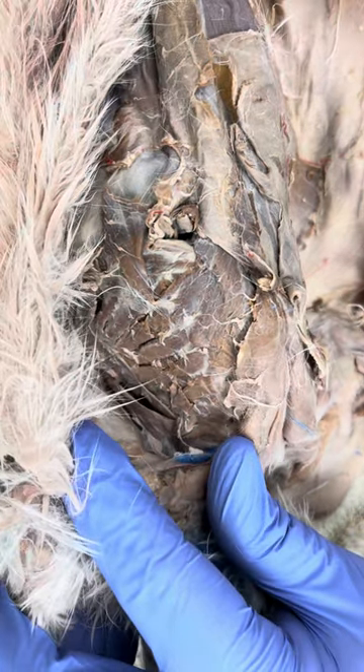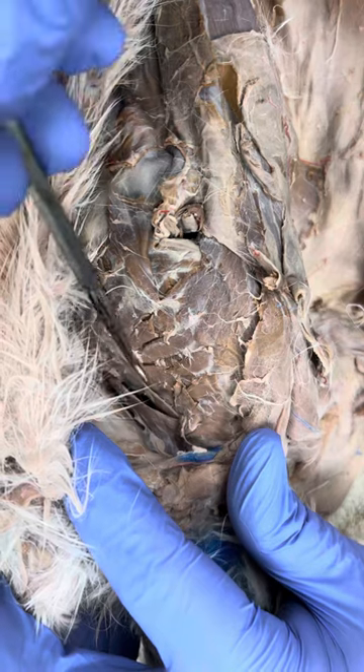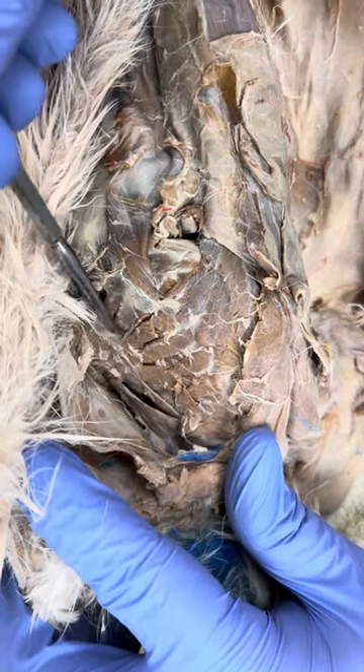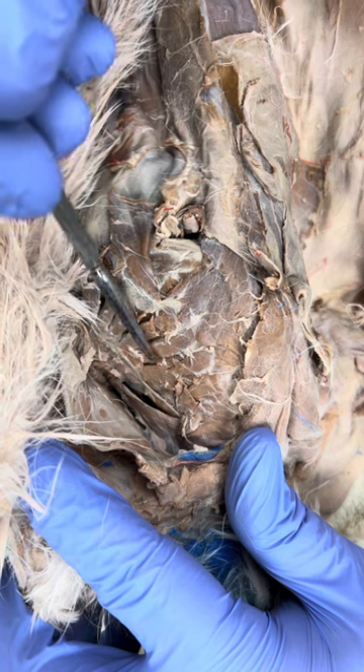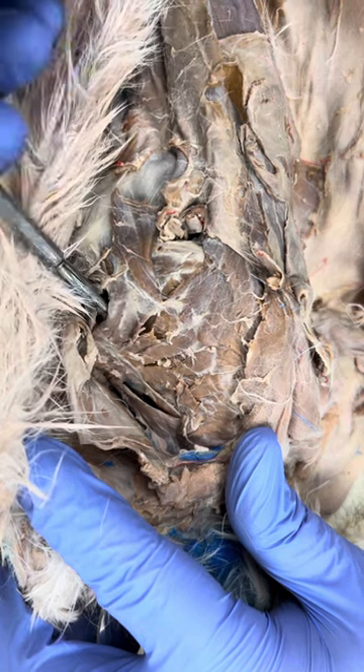We're going to be looking at the serratus ventralis muscles, also known as the serratus anterior in humans, and it's these muscles that are right here. To dissect these, I used a knife and went in here and separated these out. When you're done, it should look something like this.